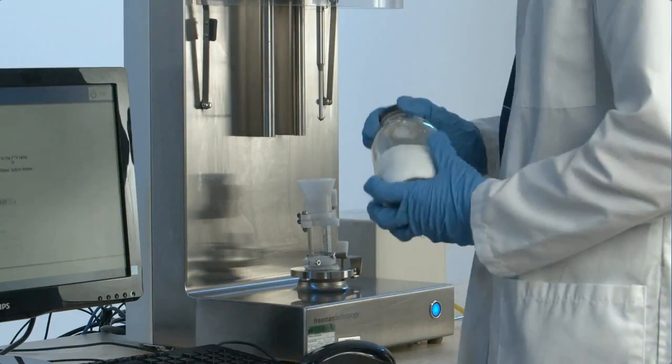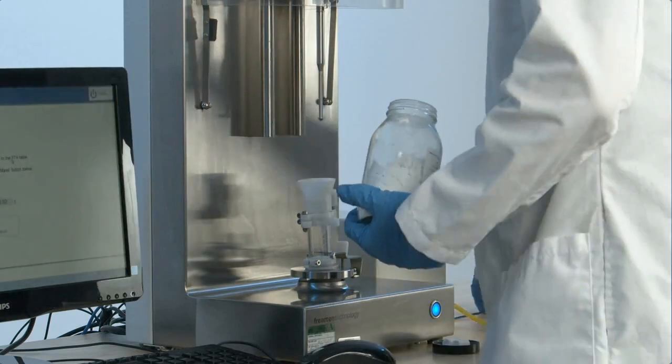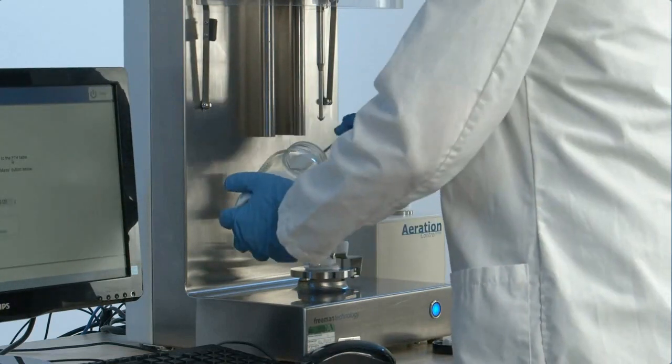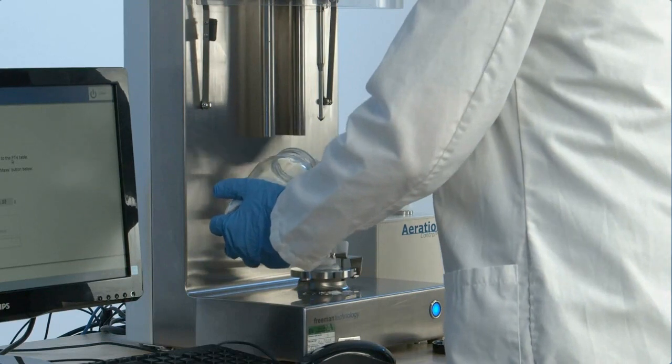And here we have some example material that we are going to be using today. At this point, you fill the vessel with the correct amount of material so that it goes above the split level.